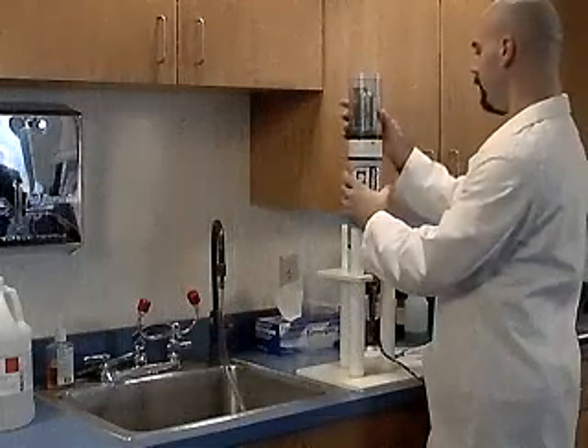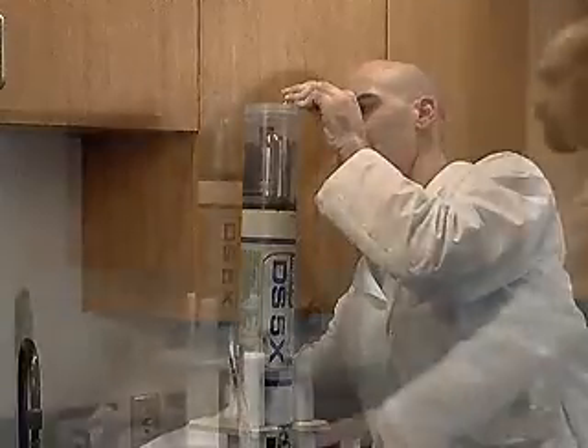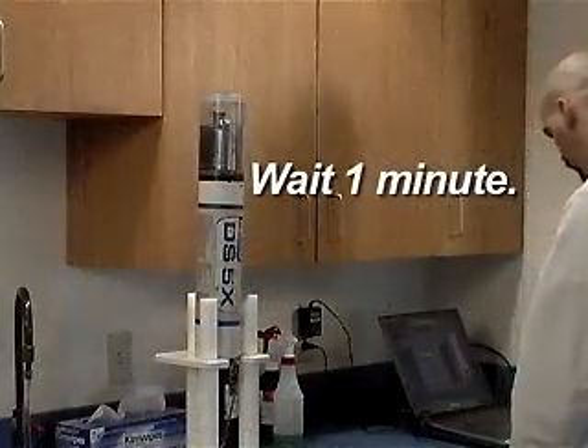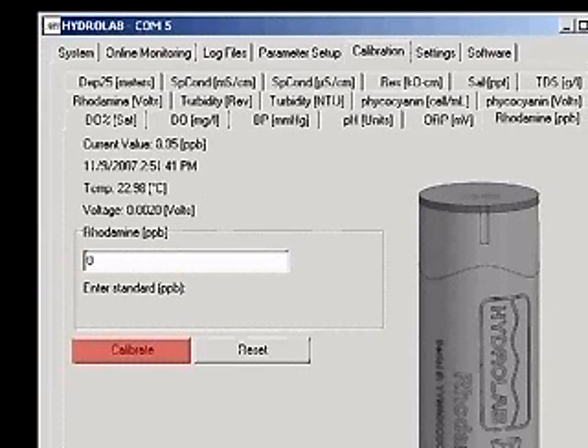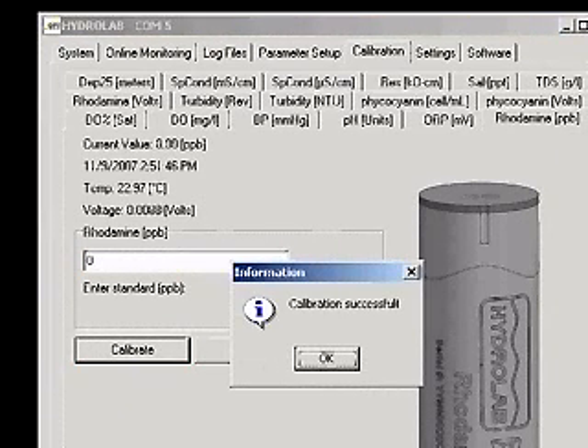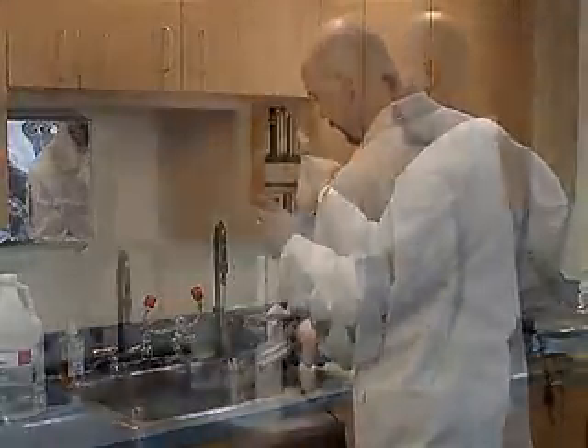Attach the calibration cup and fill it to the threads with deionized water. Wait one minute for the readings to stabilize. Type 0 into the box and click Calibrate. A calibration successful message will appear. Empty the storage cup and dry the sensors.